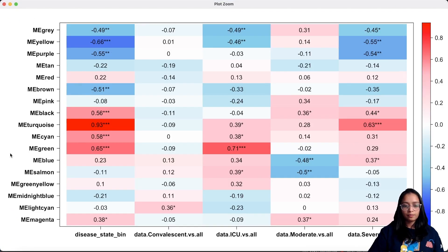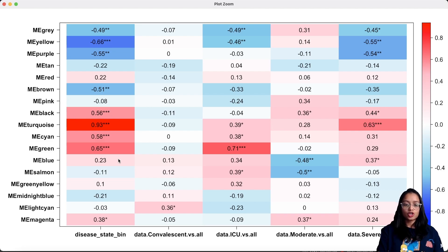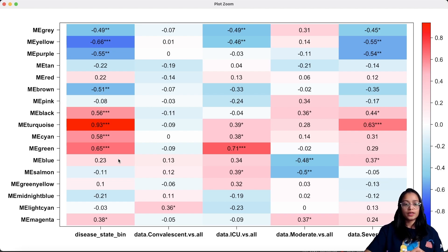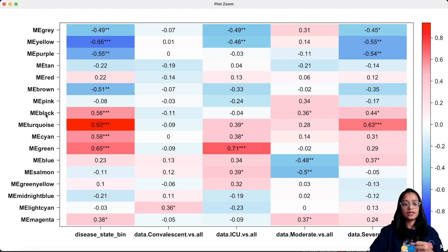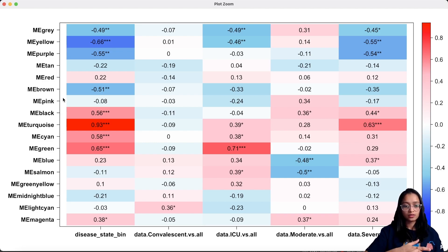Looking at this heatmap, I'm focusing on modules that are significantly associated with the trait of interest. The level of significance is indicated by the number of asterisks — three asterisks means high significance. Answering the first part of the question — which genes or clusters of genes have significant association with COVID-19 individuals — we look at modules with high significance to disease state. Here we see modules black, turquoise, cyan, green, and yellow as having high significance and being significantly associated with disease state.